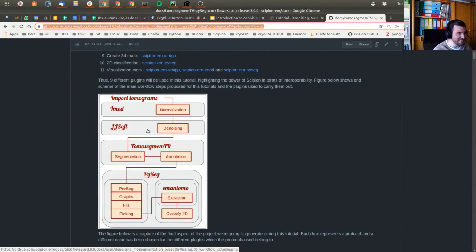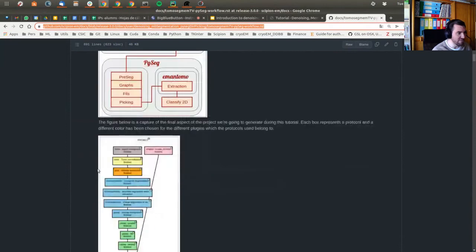So once you have everything segmented and annotated, you can go back to the original size and then move to the picking, where the size is very critical, because we don't want to lose our particles due to any mathematical filtering and so on, which could, for example, delete them in case they are very small.